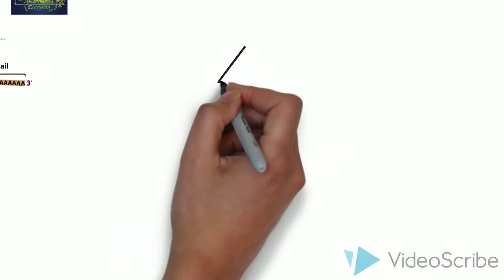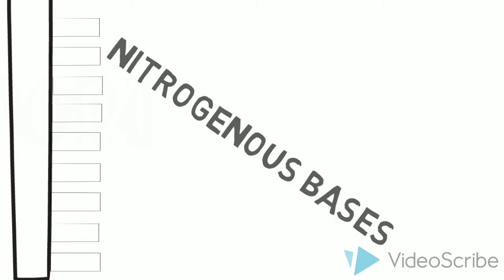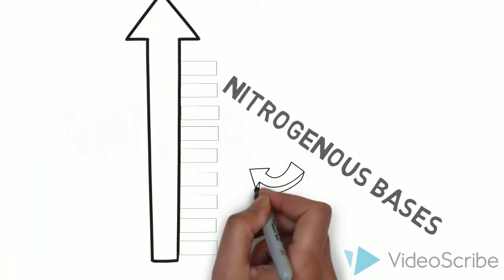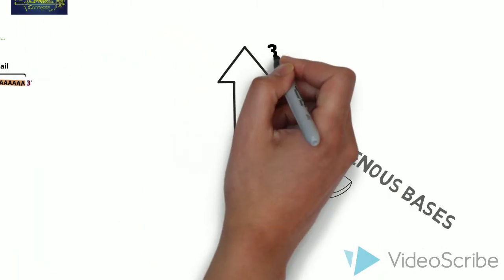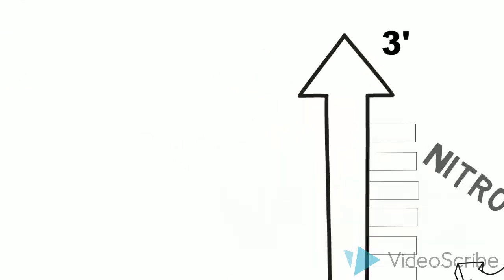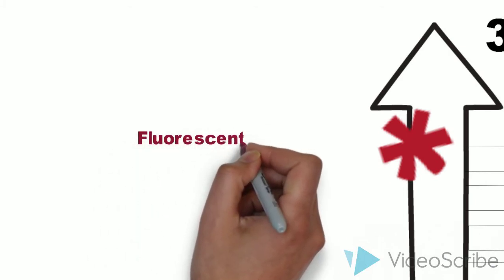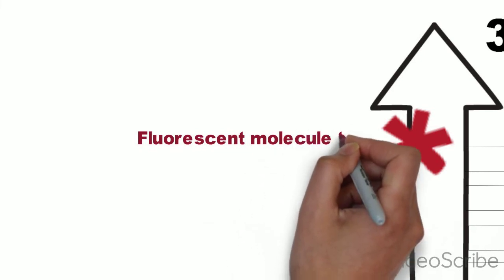During the creation of cDNA, one of the DNA building blocks used in the synthesis of cDNA carries a fluorescent tag in order to label each cDNA. Different colored fluorescent tags can be used to differentiate between cDNAs coming from different samples, allowing us to compare the quantitative data obtained from different samples.